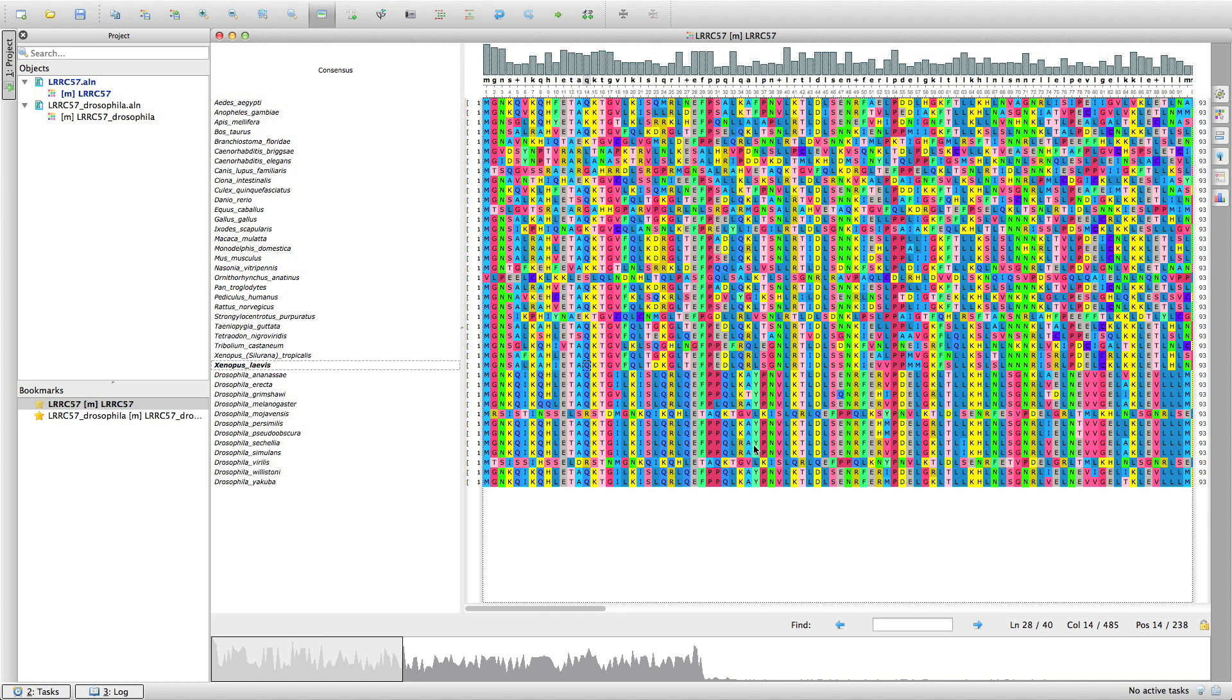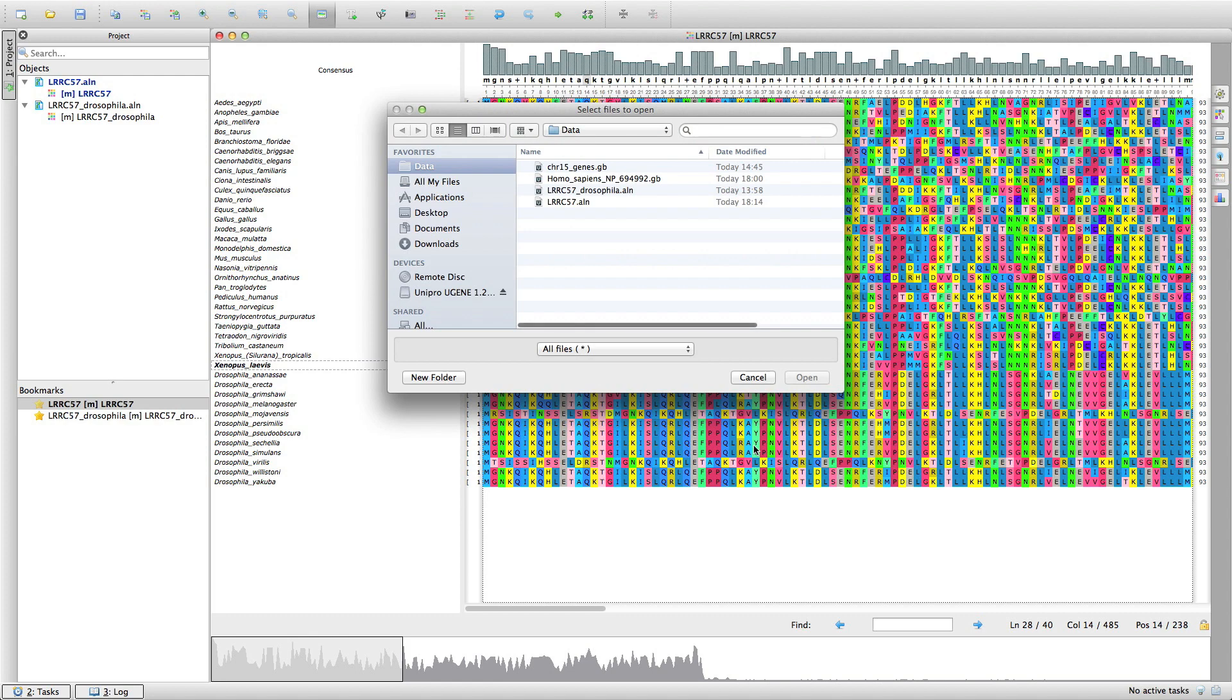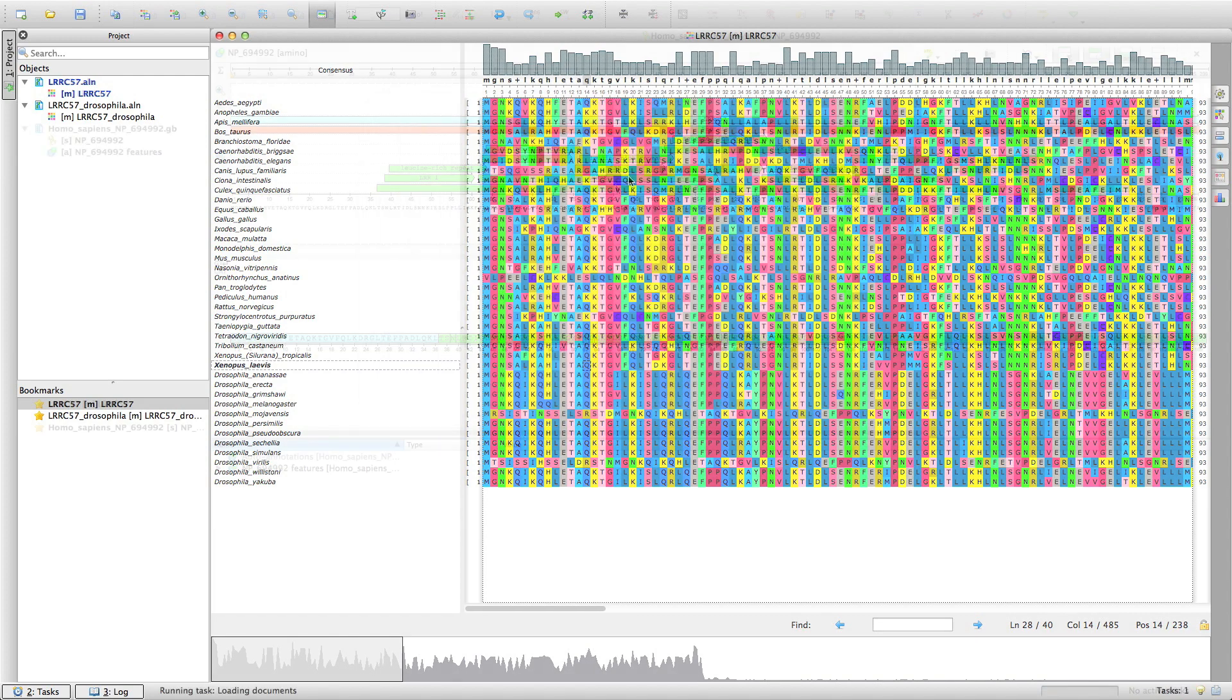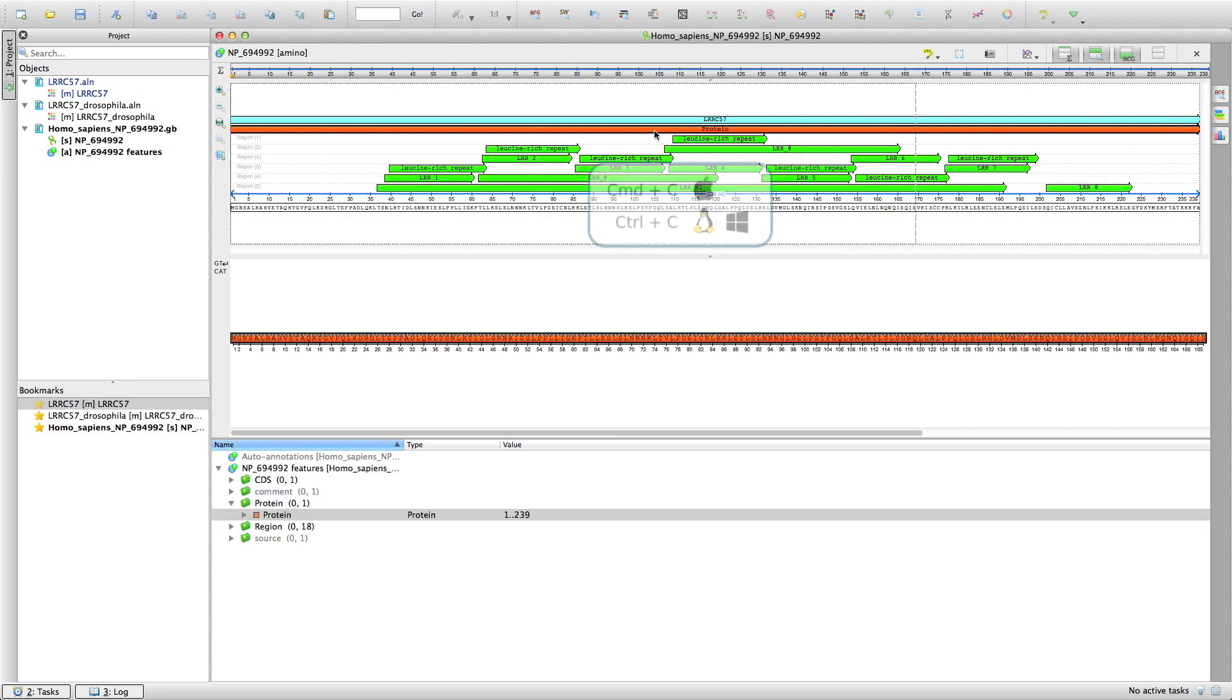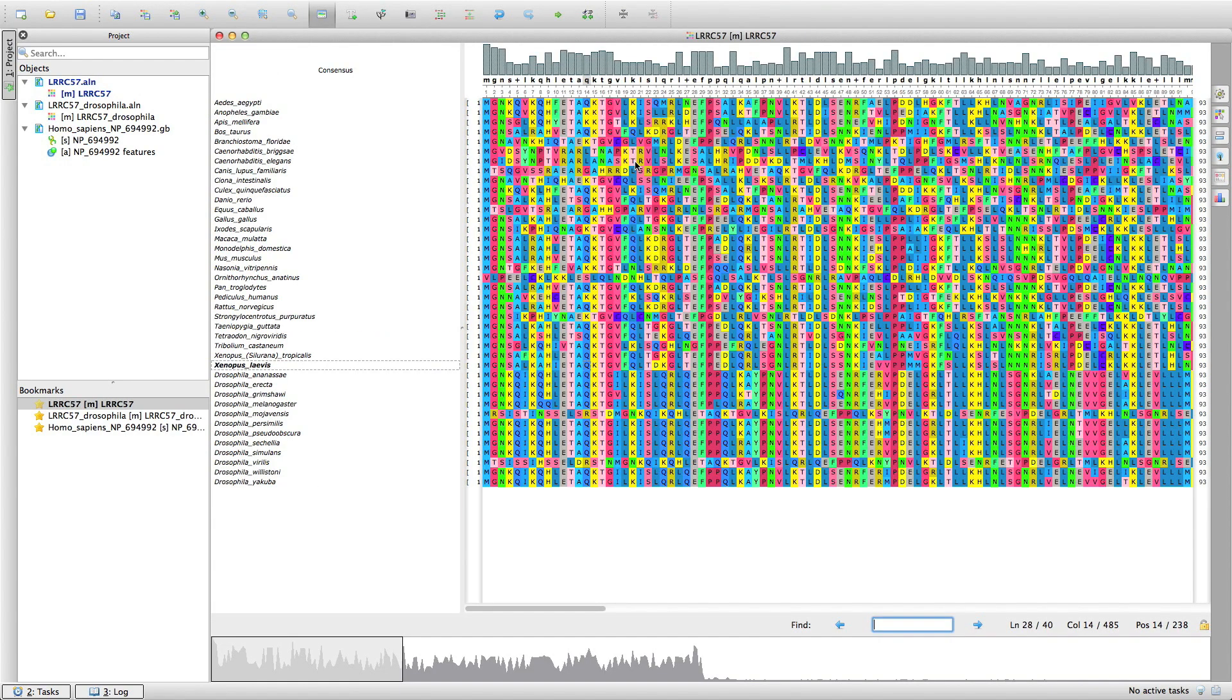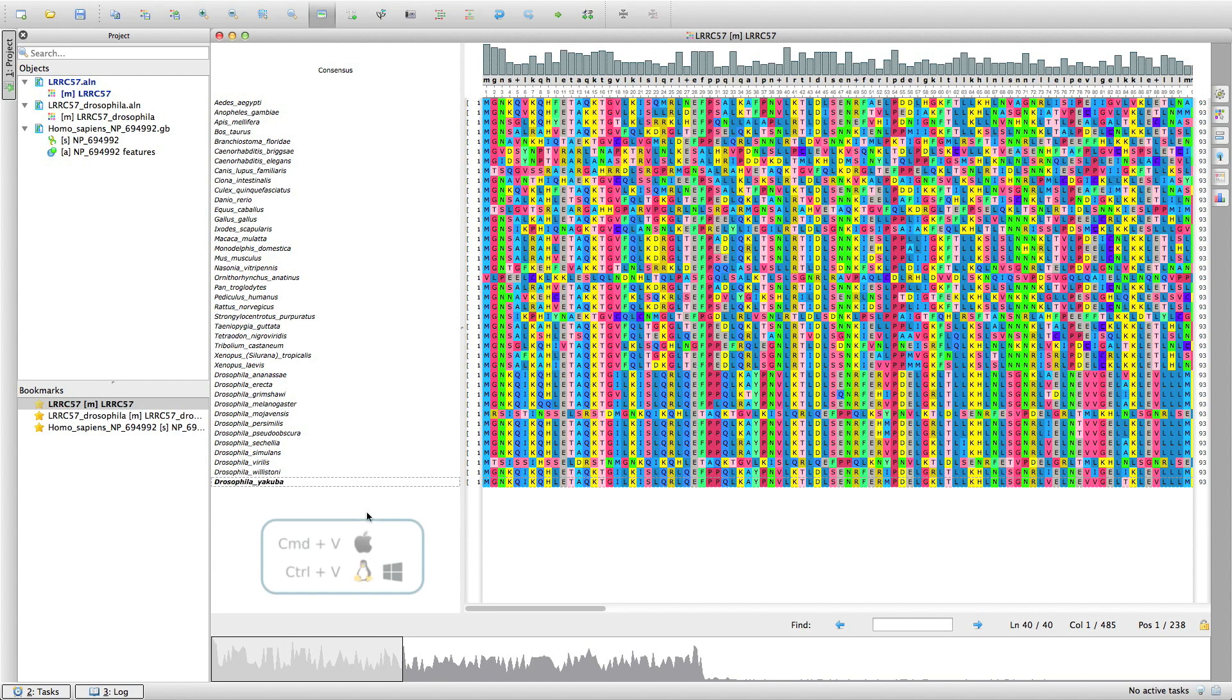But wait! There is no Homo sapiens in the list. Select the protein that in humans is encoded by the LRRC57 gene and copy it. Go to the alignment and paste the data using the standard CTRL V shortcut.